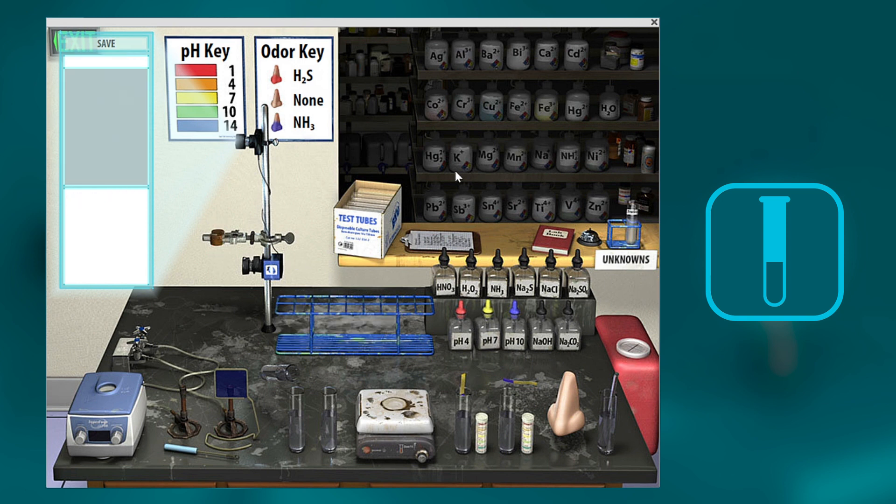You can repeat this experiment with as many different cations as you want. You can put what you need in these test tubes. Keep testing so you are fully ready to do qual analysis in the lab. We hope this helps.